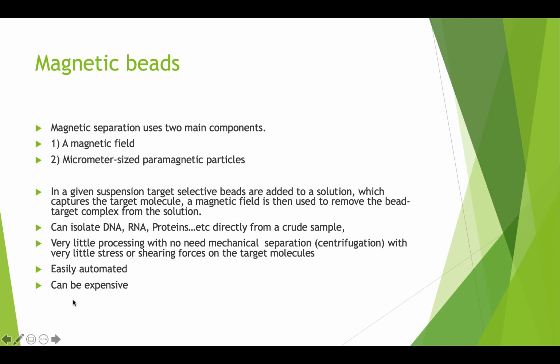There are many instruments that will come that use these magnetic beads. It can be expensive. Any technology, as you know, at its beginning is new and expensive, and then the more you use it the cheaper it becomes. Last time I bought the kit, I think it was 500 columns for 500 dinars. So it's not that expensive I think. Maybe double the price of the old method, but it has its merits and you sometimes use it.